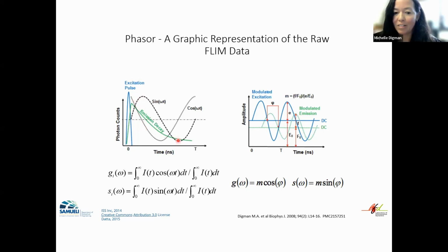Of course, that's very simple if it's single exponential, but if it's multi-exponential, and that could occur because the molecule can exist in different conformational states that give it multiple fluorescence lifetimes, then it will have a multi-exponential decay. And that happens with really big molecules, let's say GFP or some of these other molecules. But if you're looking at very small molecules such as fluorescein or rhodamine, they usually have a single exponential decay.